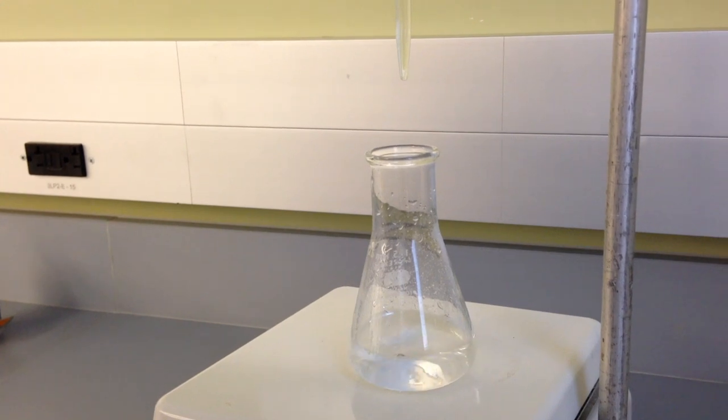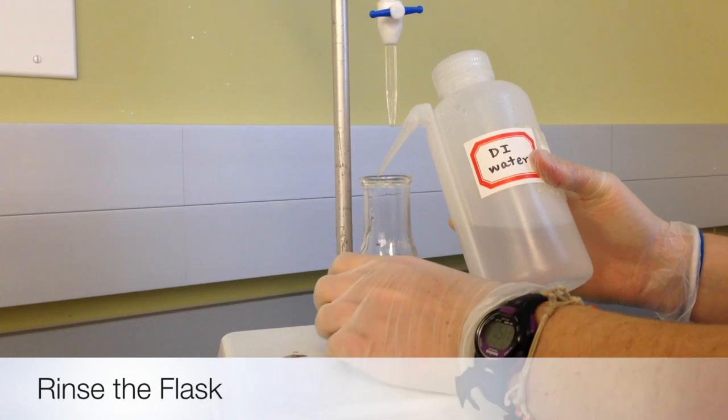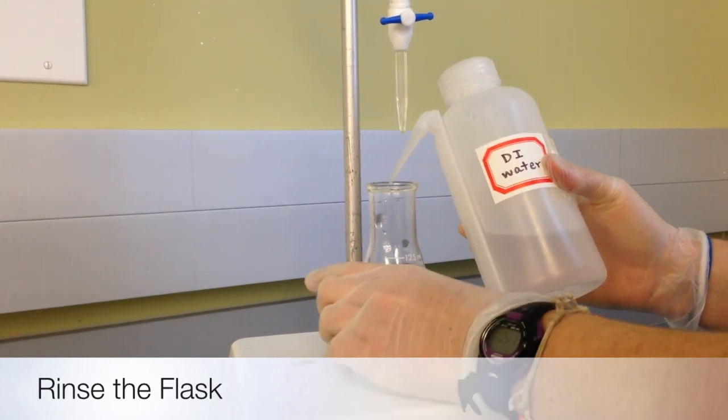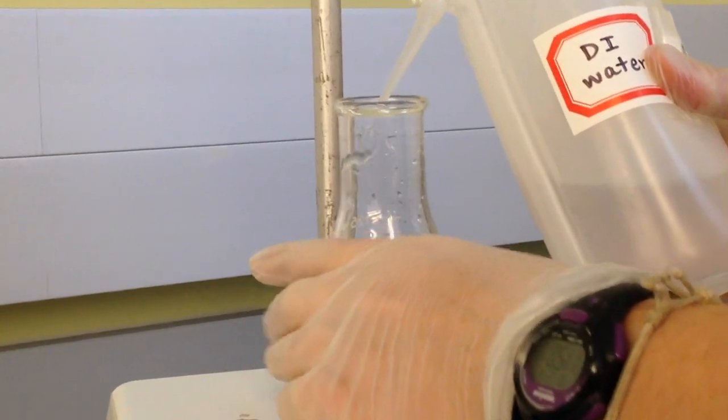So make sure the stir bar is stirring the solution steadily. And make sure you rinse the walls of the flask with about 15 milliliters of deionized water, so that all the analyte and indicator are in solution.